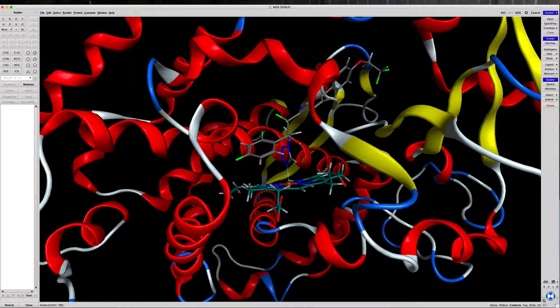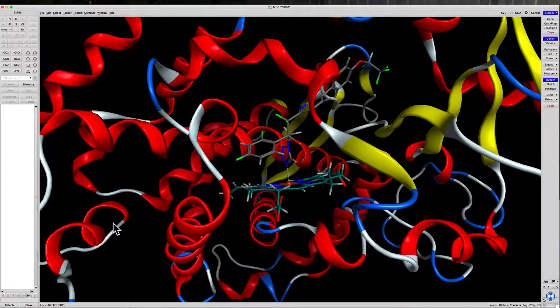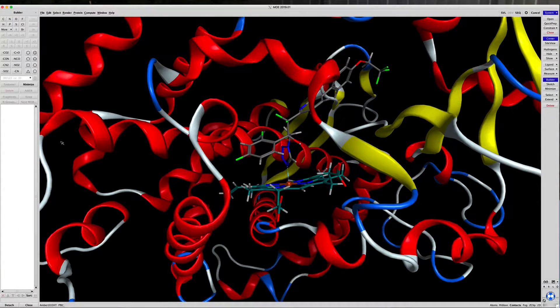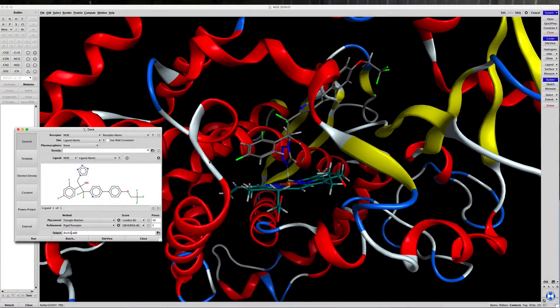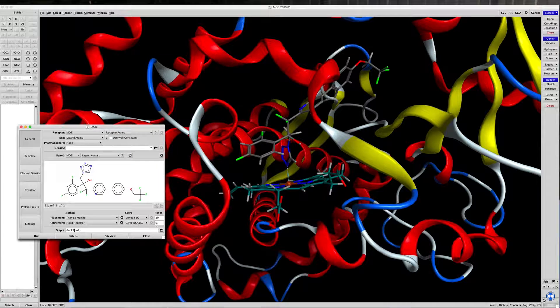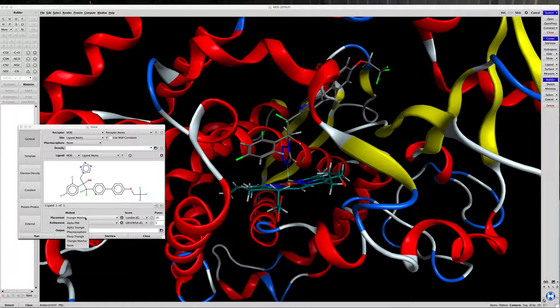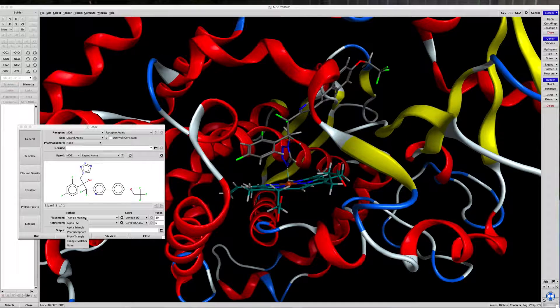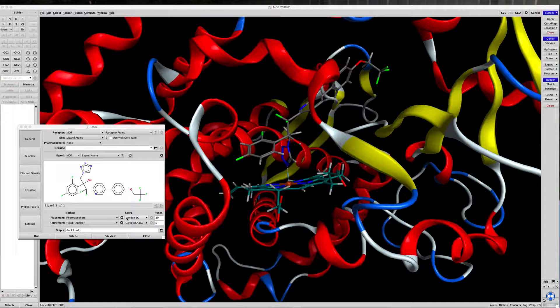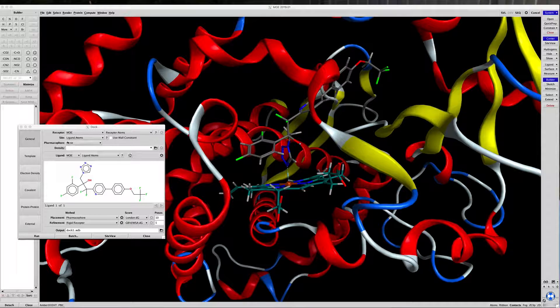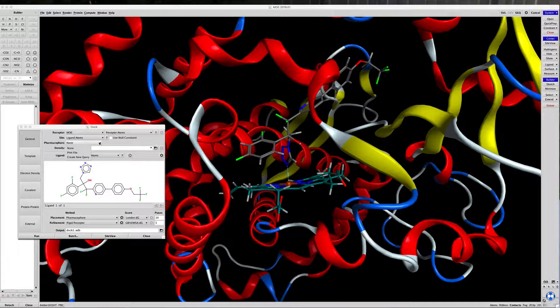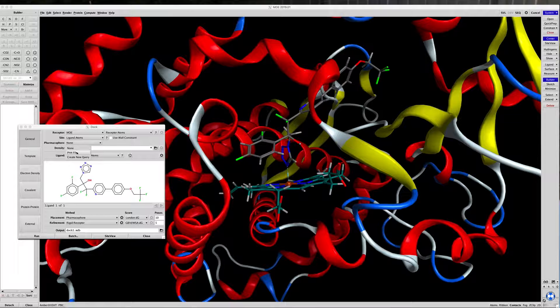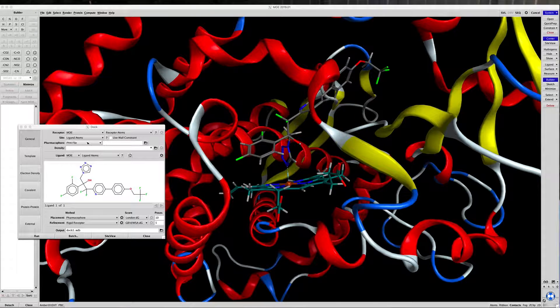So let's go back to the docking window, and we're going to use, instead of triangle matching as a placement, pharmacophore as a placement. But you have to tell the software which pharmacophore. So let's use the PH4 file that we just created.